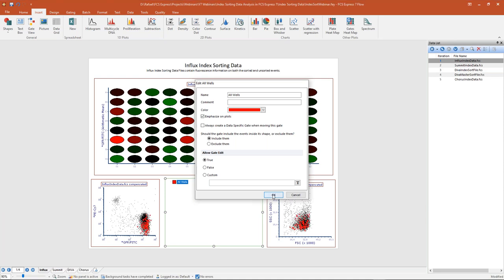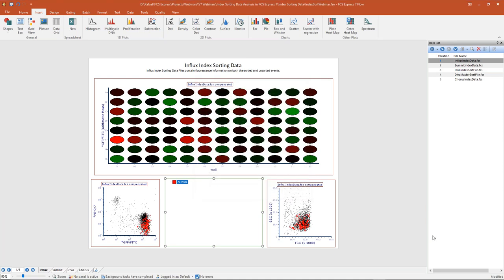I'll click OK, and now on my plots below, the events within the all wells gate are emphasized — there are large red pixels on these color dot plots, with that red color drawn from the gate color itself. This feature will be very useful for isolating one specific well from the entire plate, letting us see that single dot much easier by its size and color.